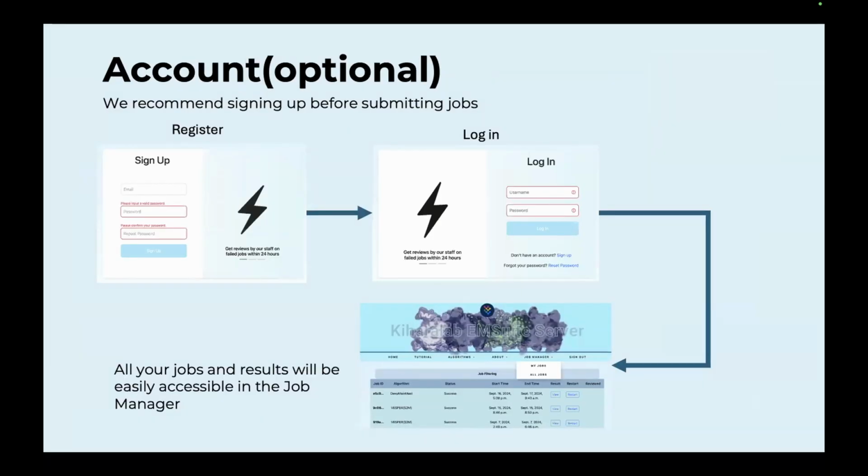Now let's start with how to use the server. You can submit jobs without making an account, but we highly recommend creating an account because you get many more benefits from it. With an account, you can easily track your past jobs, and communication with the developers is much easier.